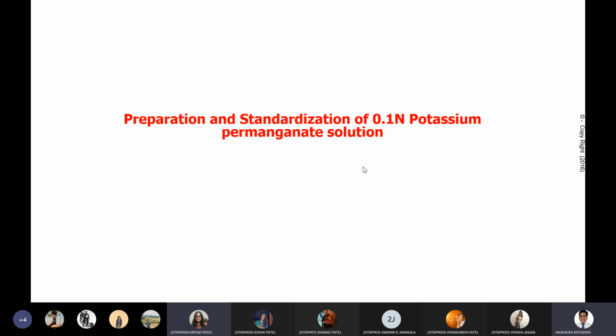Yes. So for that also you need to recall the molecular weight of that substance. At the same time, you have to calculate the number of replaceable ions. If it is an acid, then H plus, and if it is a base, then OH minus ion. So that is the case of acids and bases, if the reaction takes place in acidic medium or involves acids and bases.